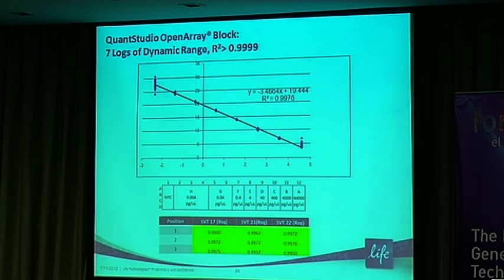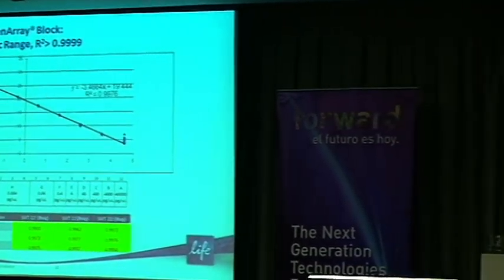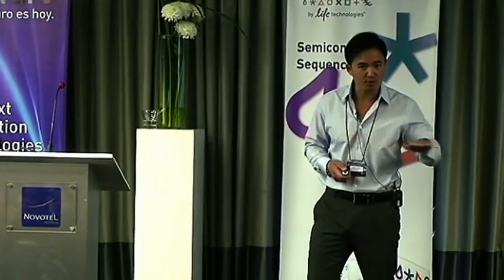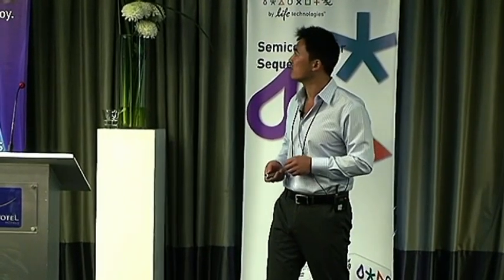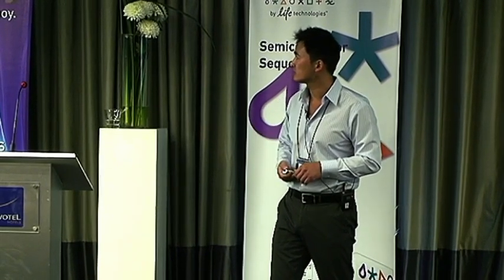That, of course, is dependent on what the assay is, what's actually in the master mix, what the rise is above baseline fluorescence, and also where you set the threshold to determine that CT value. And the CT value is what you're seeing here depicted in the y-axis.